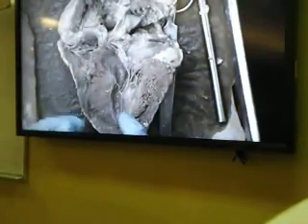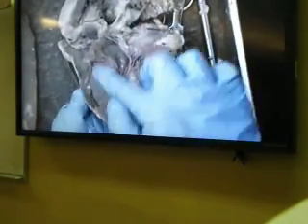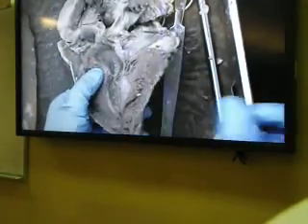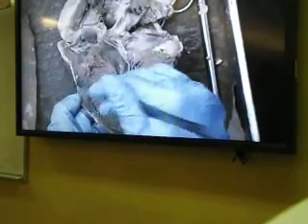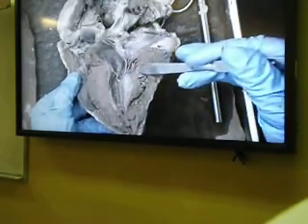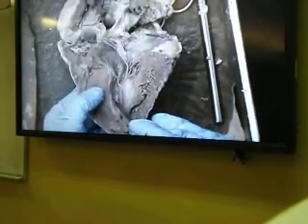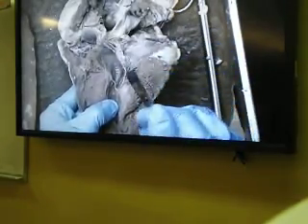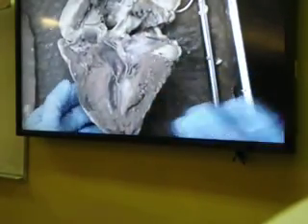Okay, once you cut, the first thing for us to understand is the muscular separation that's separating the two sides, which we call the interventricular septum. Once we understand that, we go to either side and see which side of the interventricular septum has the thicker wall. So this side has the thicker wall, so I know this chamber has to be the left ventricle, because the left ventricle works more, pumping the blood via the aortic semilunar valve into the aorta all over the body. So if you work out, you have more muscle.